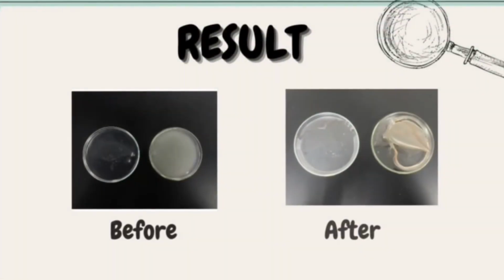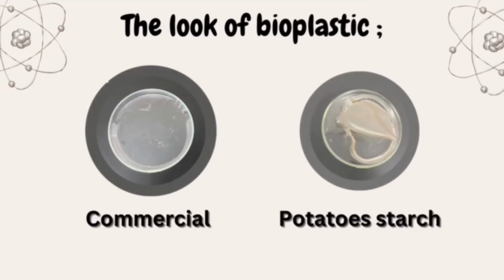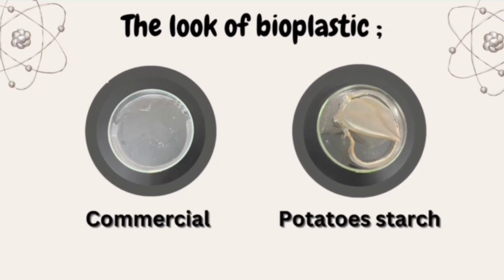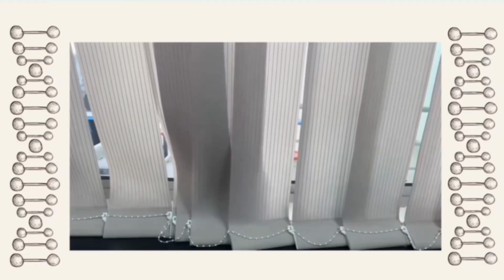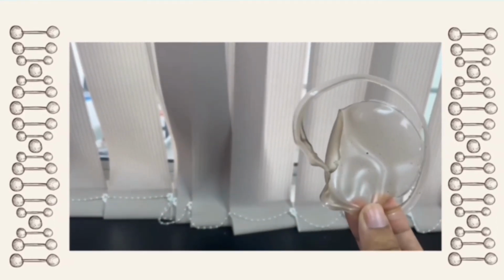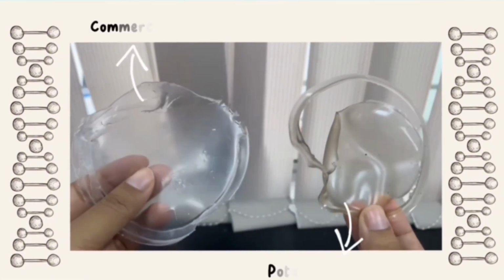Okay, so this is our result before and after 3 days of drying at room temperature. In our results, from the figure, we can observe the differences in the color of the bioplastic. As we can see in the left picture, the bioplastic produced from commercial starch appeared clearer compared to the bioplastic made from potato starch in the right picture, which had a slightly cloudy appearance. Next, this video shows the comparison of both bioplastics in terms of texture or properties.